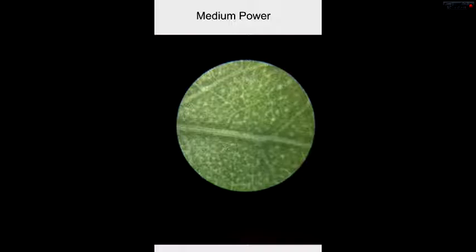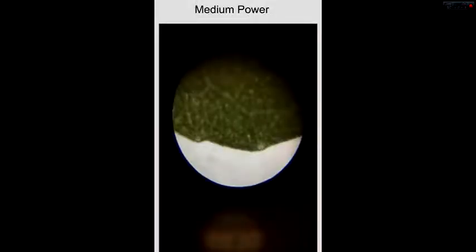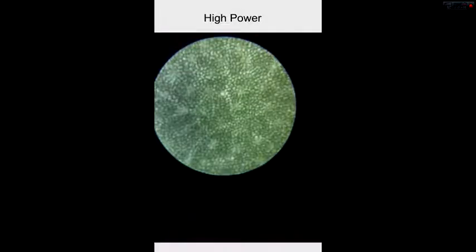This is a picture of the leaf under medium power. You can see the green oval cells and the stem and veins and all of that stuff. Here's more of a picture of the outer edge of the leaf, also under medium power.